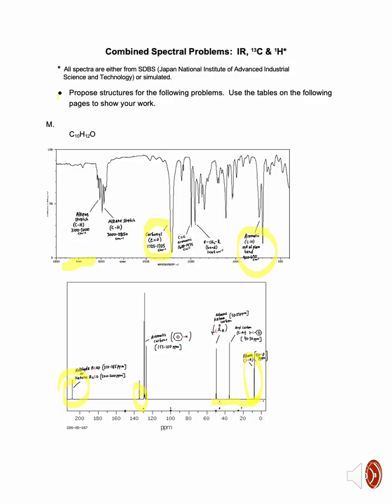Additionally, the strong peak between the ranges of 135 to 125 ppm, right around here, is likely due to an aromatic structure or internal double bonds, in general. The two peaks between the 50 to 10 ppm range are likely from carbons adjacent to ketones and aryl CH bonds, so right over here.